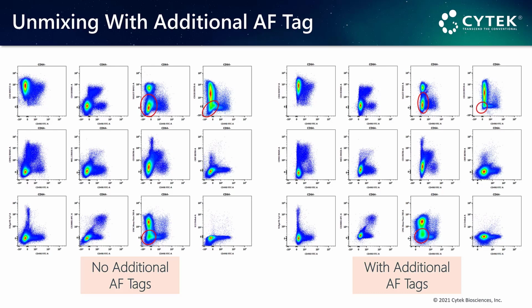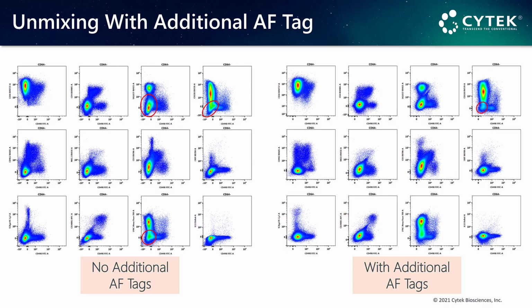Note the much tighter negative populations, and these comparable data are scaled identically, so the impact of the improvement is hidden within the compressed scaling of that negative. So when I optimize the scaling of that 20 color data, now we can see that our negative populations are clean and well resolved, and in particular, we can determine where the CD11b and CD49b double negative events begin and end.